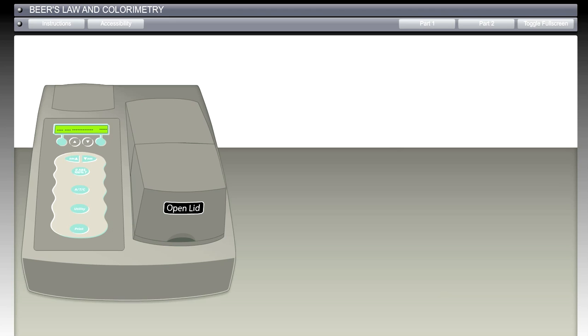Hello, my name is Rennie Vogt-Lowell and we are about to have a quick demonstration of the Beer's Law and Colorimetry Spectrophotometry Science Lab.